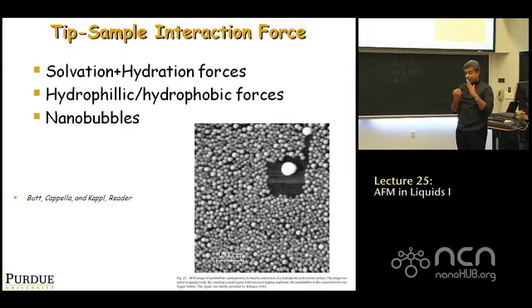So as you bring the tip close to the sample, the two solids prefer to be stuck to each other as opposed to being surrounded by water. And you get large adhesive forces, what appear like adhesive forces, that are not really van der Waals, but are simply due to these interactions. Two hydrophobic surfaces in liquids will want to be together.